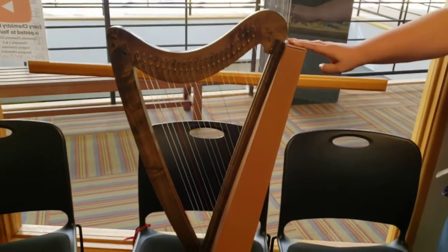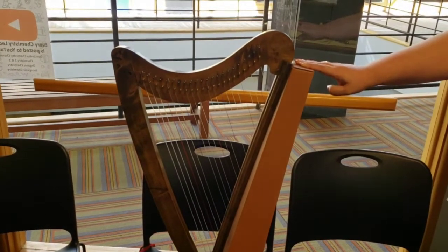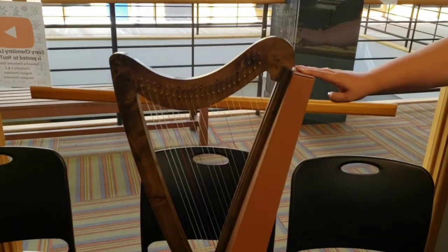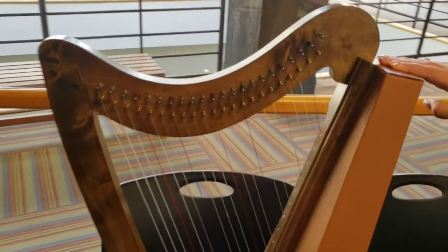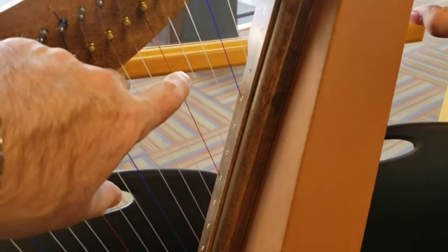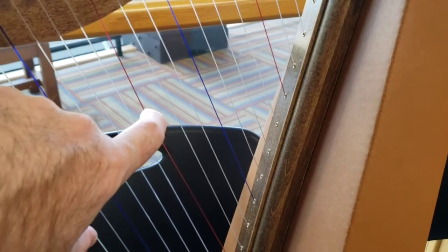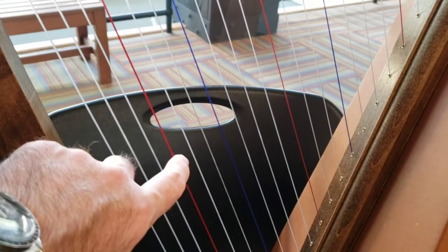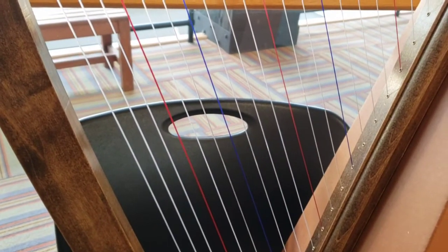The frequency with which covalent bonds vibrate depends largely on two factors: the mass of the atoms in that bond and the length of the bond itself. This is a harp. And if you pluck a short string, its tone is much higher frequency than a longer string. And the longest string has a lower vibration.